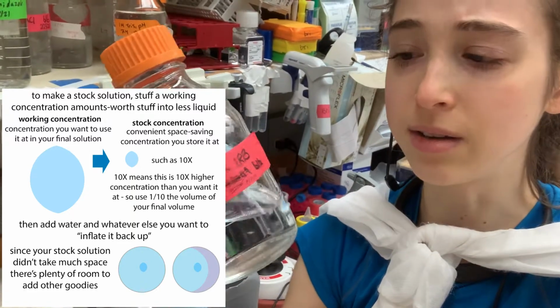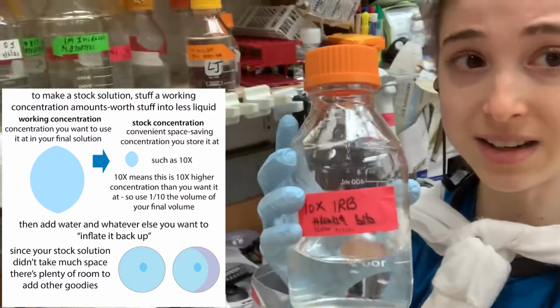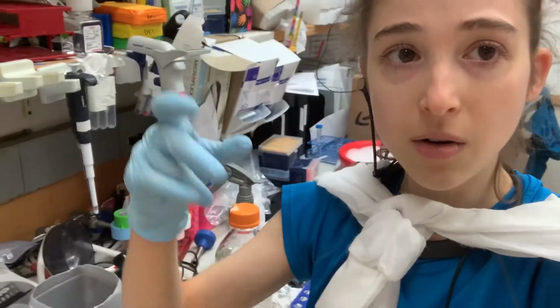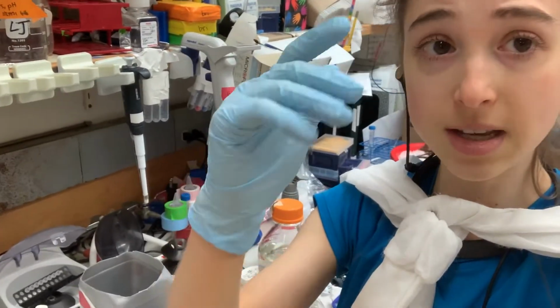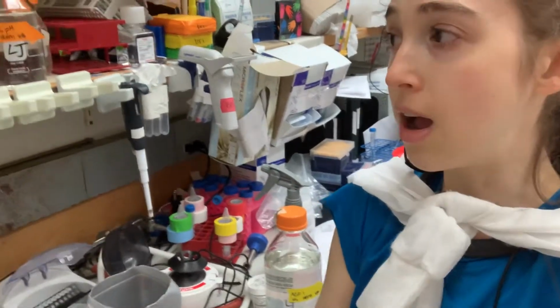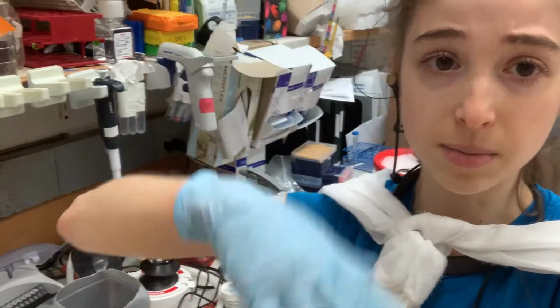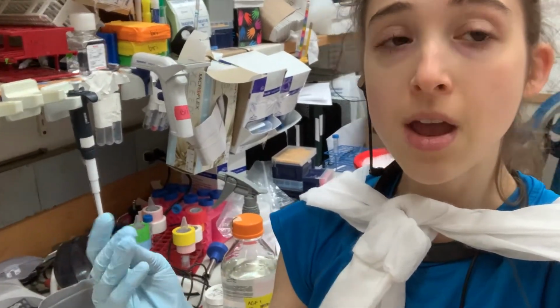Did I say 10 to 100? I would use 10 mils, add 90 of water to get to 100 mils. So typically what I do would be add 10 and then fill to 100 in a graduated cylinder and then filter it out. If I wanted 200, I do 20, fill to 200, so that'd be adding 180 of water, and then filtering it out.